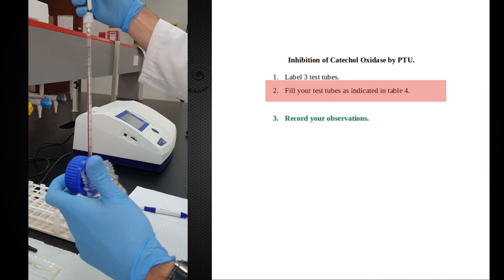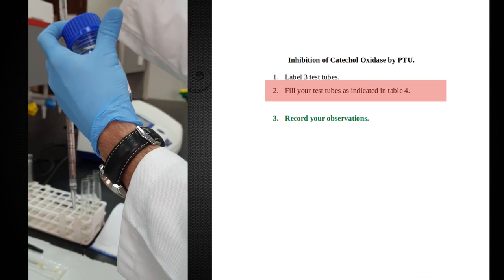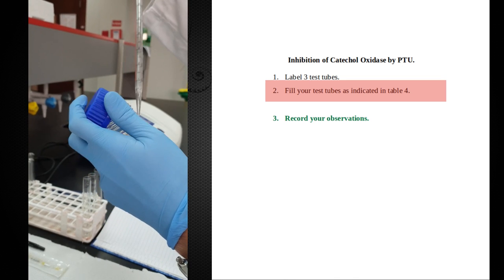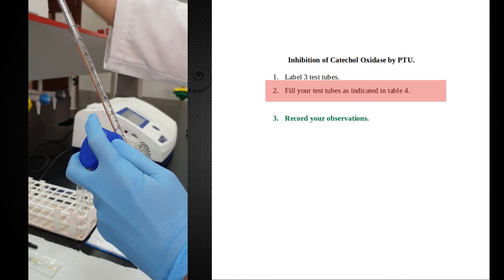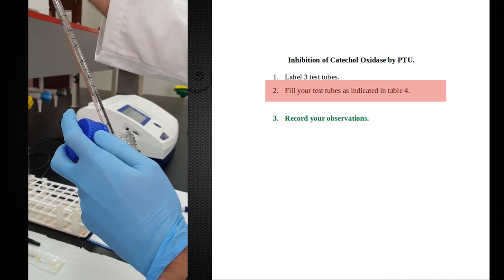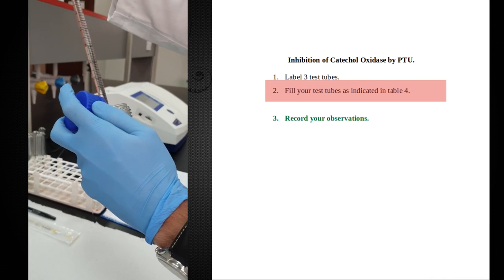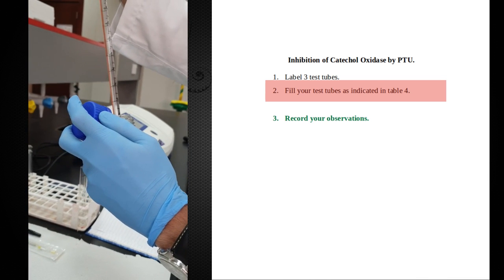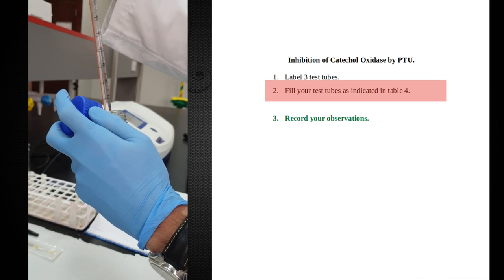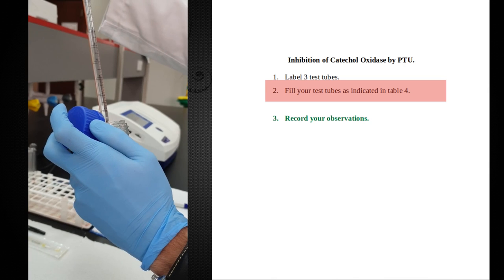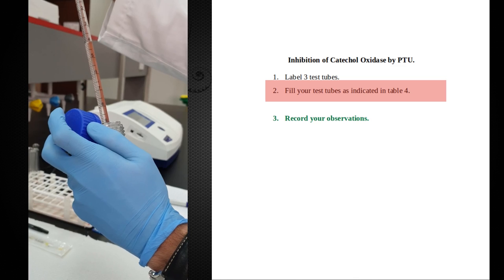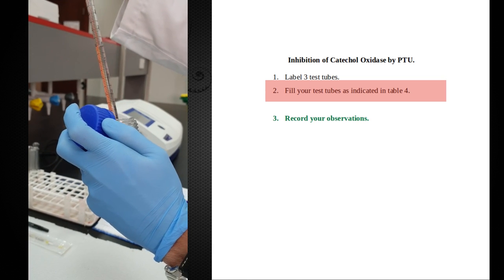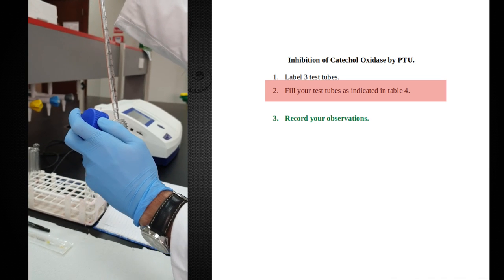I'm going to reset the plunger and the last tube gets 6 milliliters of water. I'm going to bring it up to 6. Now, depending on how you look at this pipette, you're going to see different numbers. On this side it says 4, on this side it says 6. The numbering starts from the bottom in this case - 0, 1, 2, 3, 4, 5, 6. On the other side with larger numbers, the 0 is at the top. That's why the numbers are different. Make sure you're using the right side of the pipette to figure out what volume to use. It's a very common problem for students initially.